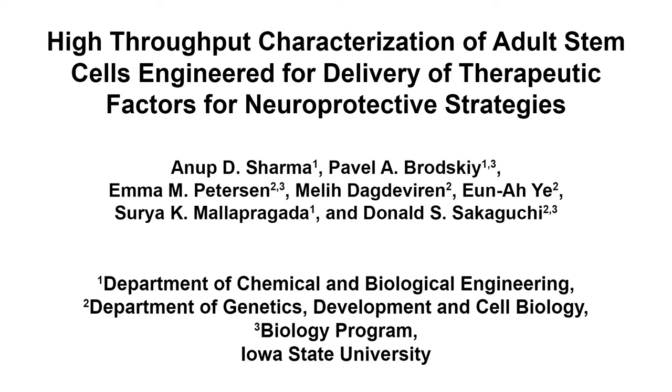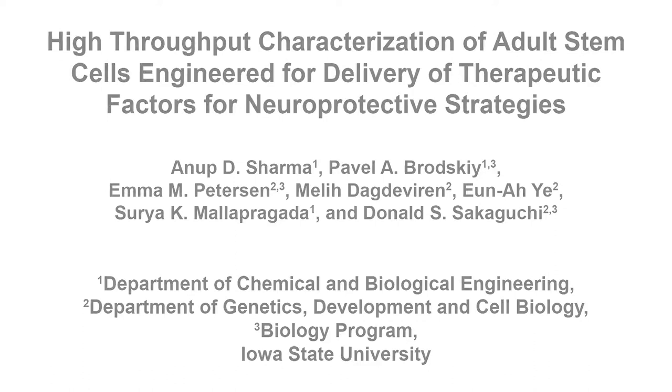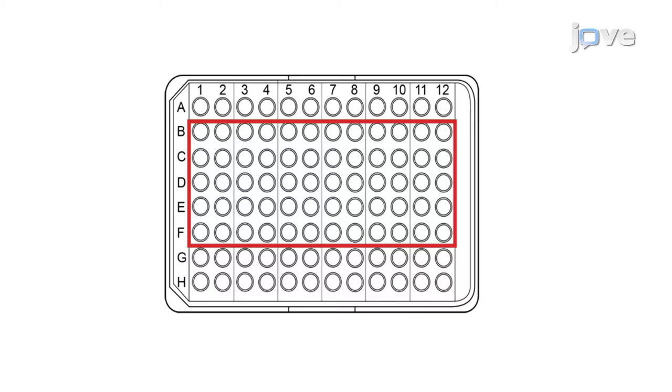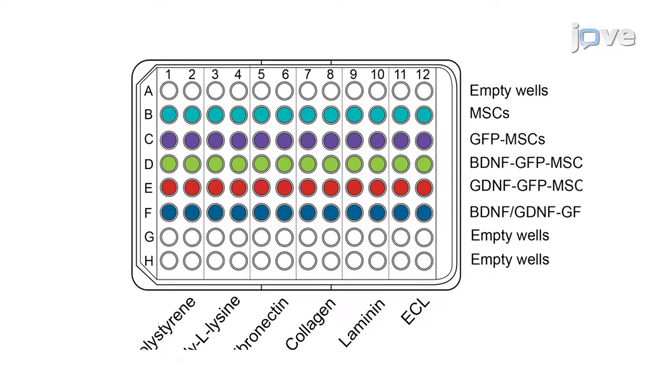The overall goal of this procedure is to rapidly characterize genetically engineered stem cells using a high-content screening, or HCS, system. This is accomplished by first designing and preparing experiments for a 96-well plate, and then plating the different populations of engineered stem cells.